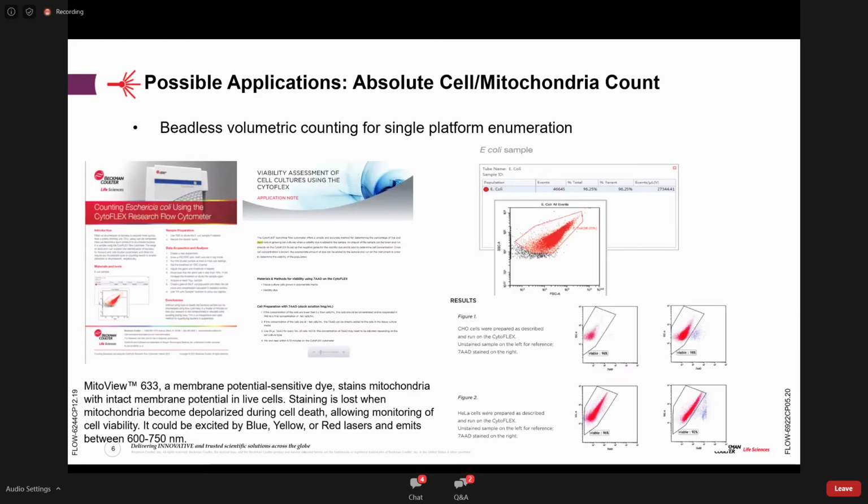One of the most straightforward applications of flow cytometry in every field is the absolute cell count, as well as the enumeration of live and dead cells. For example, it could be used for counting of mononuclear muscle cells in culture. Some newer instruments on the market, like Cytoflex, no longer require the use of beads to count cells. The cells could be counted directly by counting the number of fluorescent events.